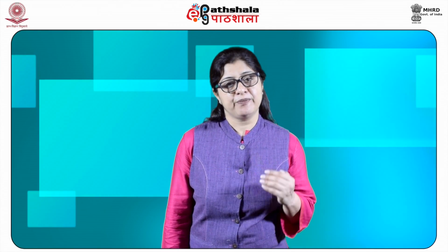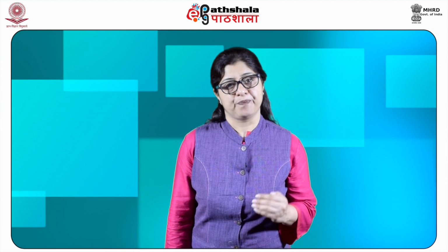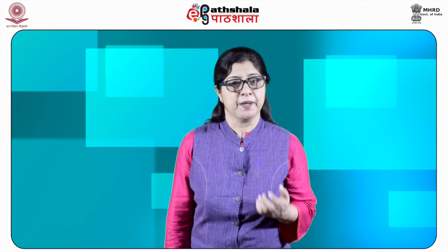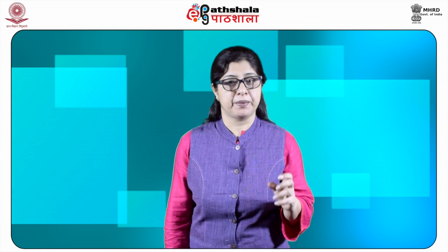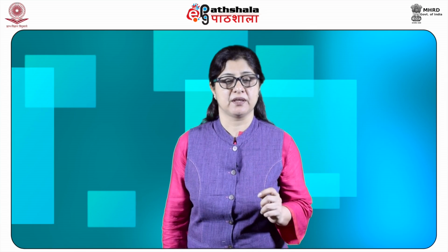If the active polyvalent ion in the resin is to be exchanged with the ion of a lower valency, the exchange has been found to be favorable by using a much higher concentration of the solution. The quality of an ion exchange resin is determined by its capacity, which in turn depends upon the total number of the ion active groups per unit weight of the material.